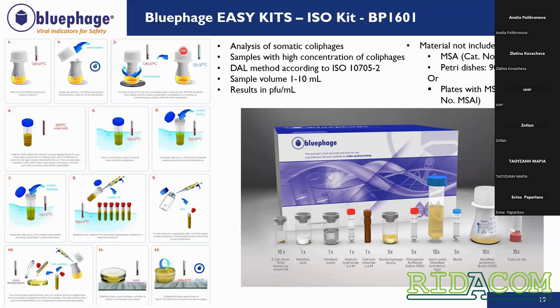And the results of this analysis are in PFU, plaque forming units per milliliter. Okay. And as we said, this methodology is according to the ISO. On the left side of the presentation, you have the summary of the procedure. But what we are going to do now is show you a video on how to perform the analysis step by step.